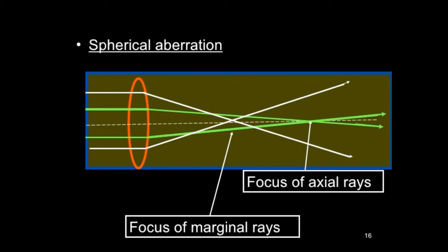Okay, so we have a sort of a negative focus difference, and that means that wherever you go, you get some kind of a confusion, a circle of confusion. Also, the point spread function never gets to this ideal feature.